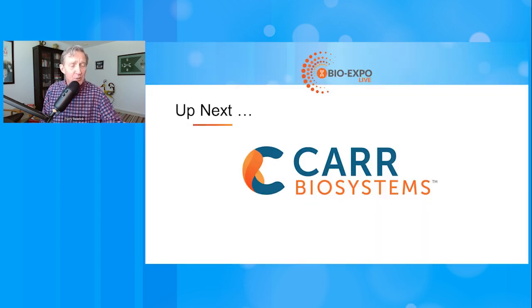He's going to present case studies to illuminate critical process parameter considerations such as shear, separation efficiency, and process speed when developing separation processes, including primary clarification, cell retention, wash, and concentration. And we're going to learn about how tubular bowl centrifugation works.